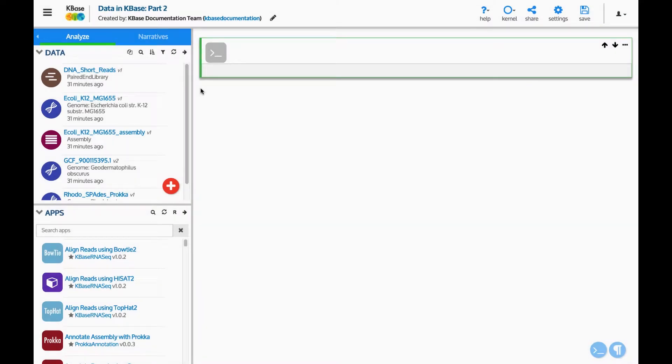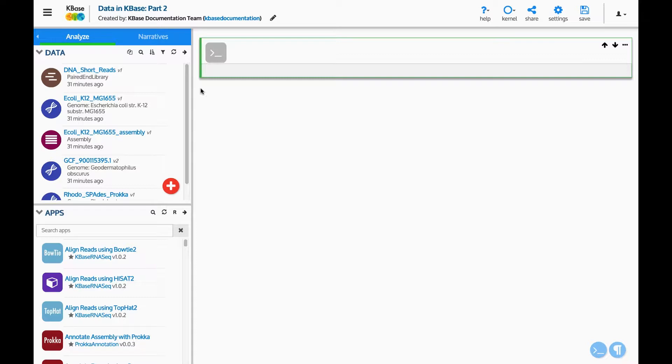Welcome to part two of the data panel tutorial video series. In this video we will demonstrate how to manage and view data in the narrative, KBase's primary user interface.